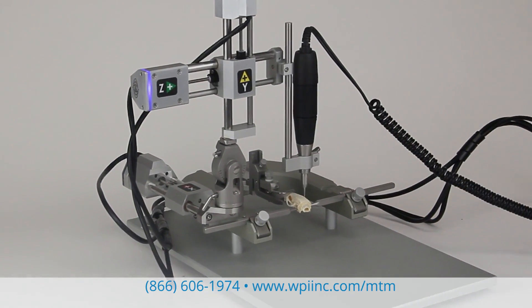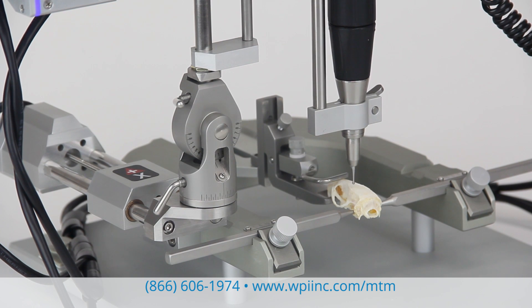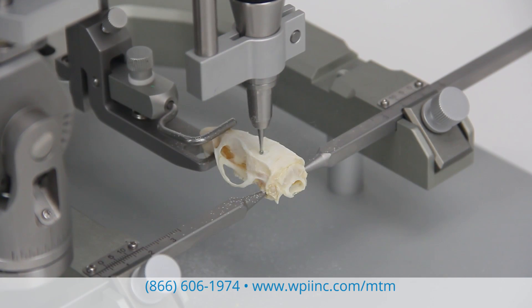Hi, I'm Lisa at WPI, where we're instrumenting scientific ideas. Today I'd like to show you our new motorized stereotaxic frame. When precision and repeatability of motion are critical, the MTM3 motorized stereotaxic frame is an excellent choice.